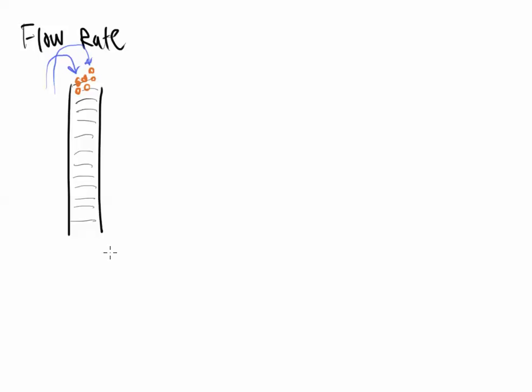The mobile phase going into the column and being pushed through the column, I have to make sure that this stays consistent. I want it typically the same from beginning to end. I don't want to change my flow rate up unless I absolutely have to. So bottom line, I have to control the flow rate. And the pump allows me to control the flow rate.